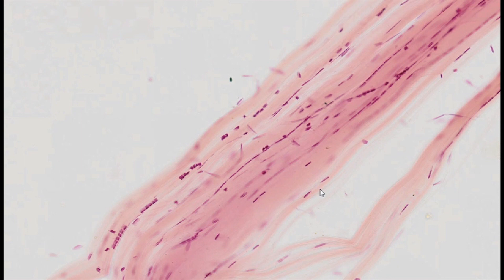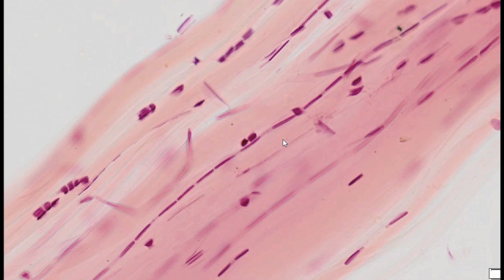The specimen is an isolated tendon stained with routine histological H&E staining. This method does not allow visualization of the cross-striation pattern characteristic of collagen, which is only visible in electron microscopy.